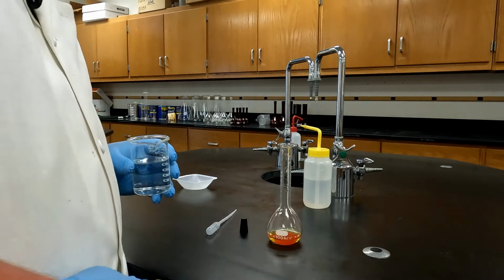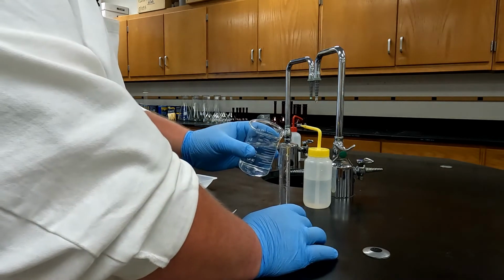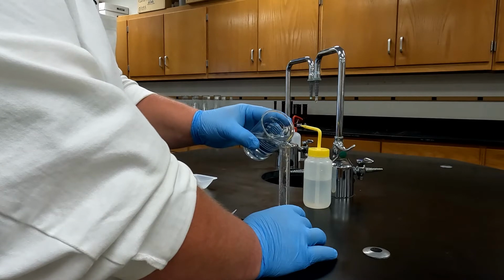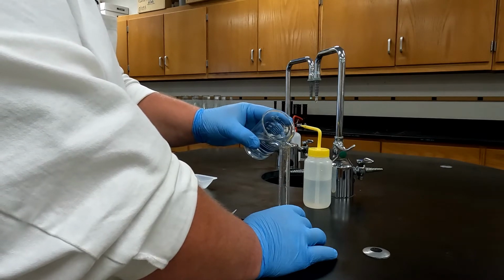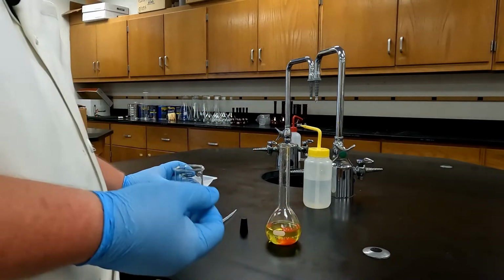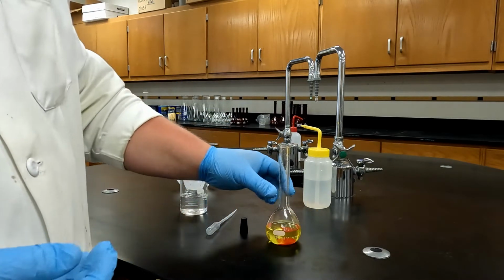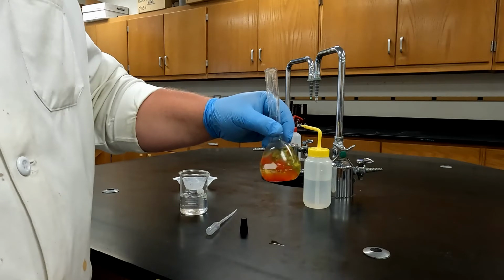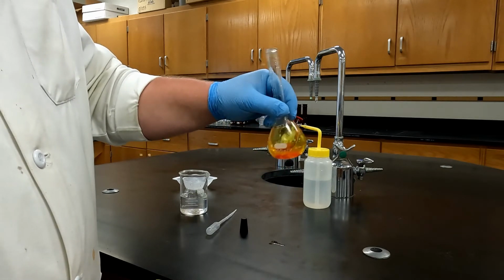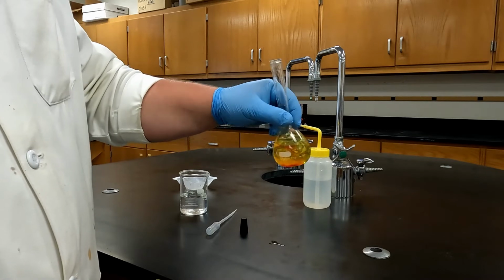I'm then going to slowly and carefully use my beaker to pour some water until the bulb of the flask is about half full, being careful not to spill anything on the outside. Once the bulb is full, I'm going to pick up my flask and I'm going to swirl it. And while I'm swirling, I'm trying to get all of the solid to dissolve.